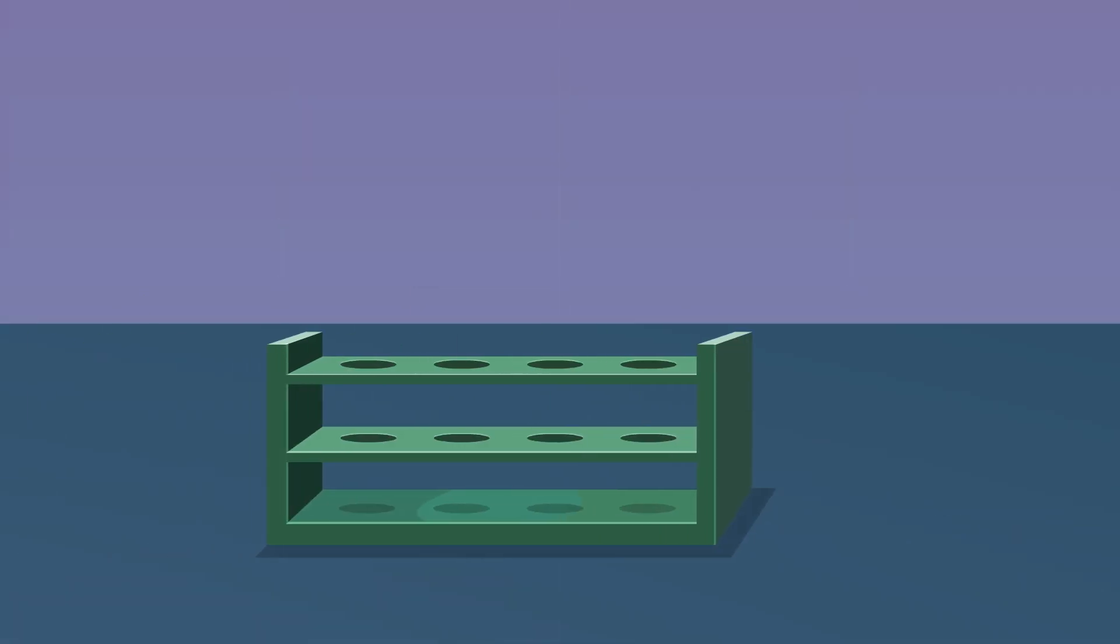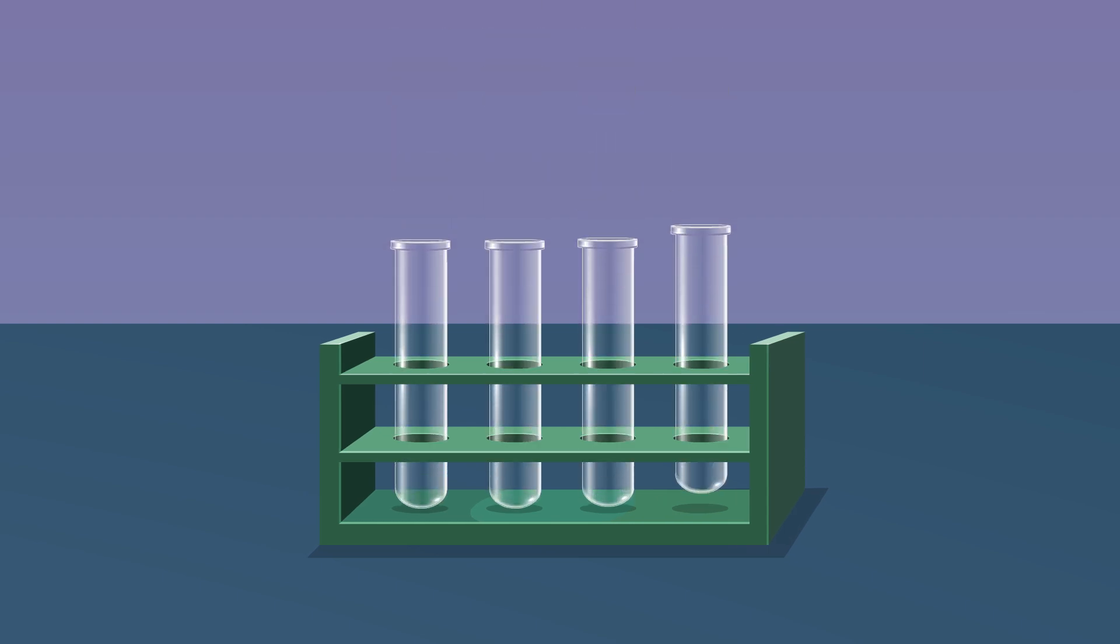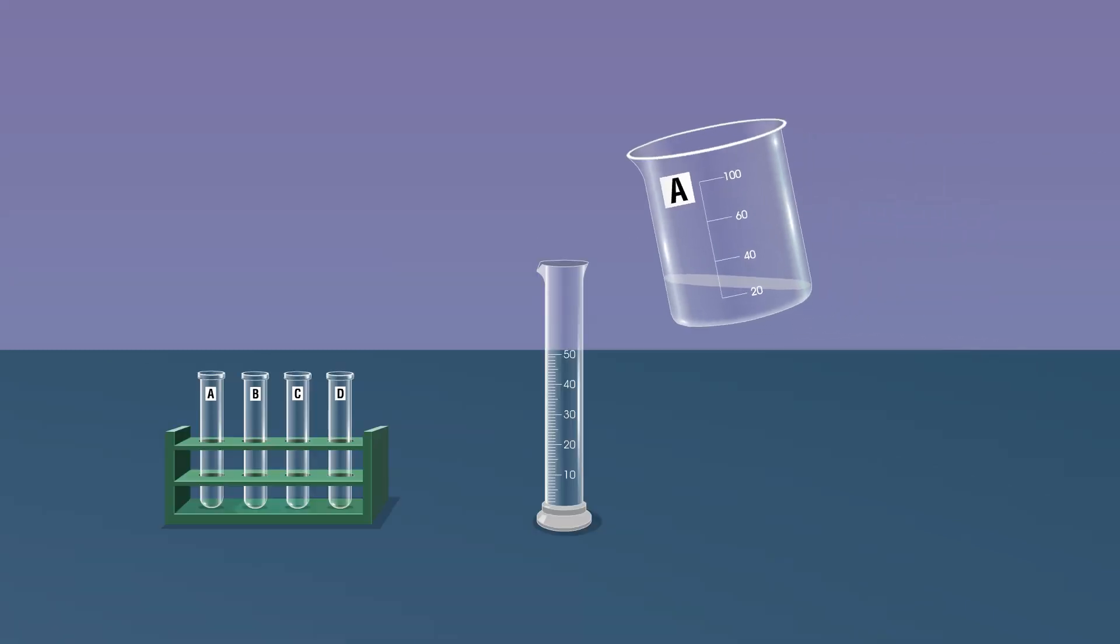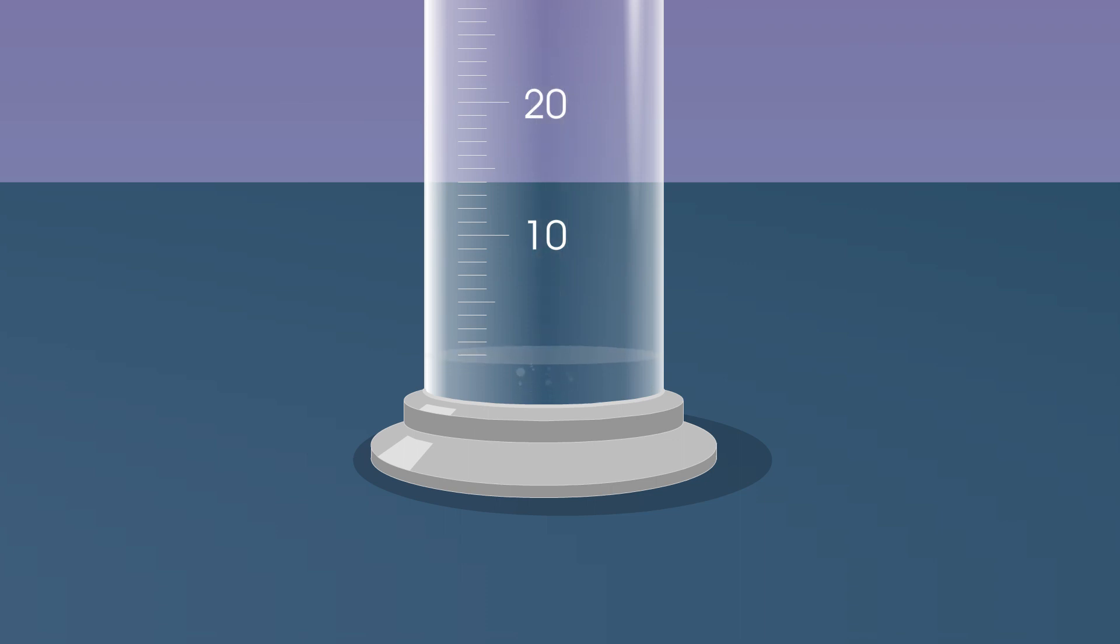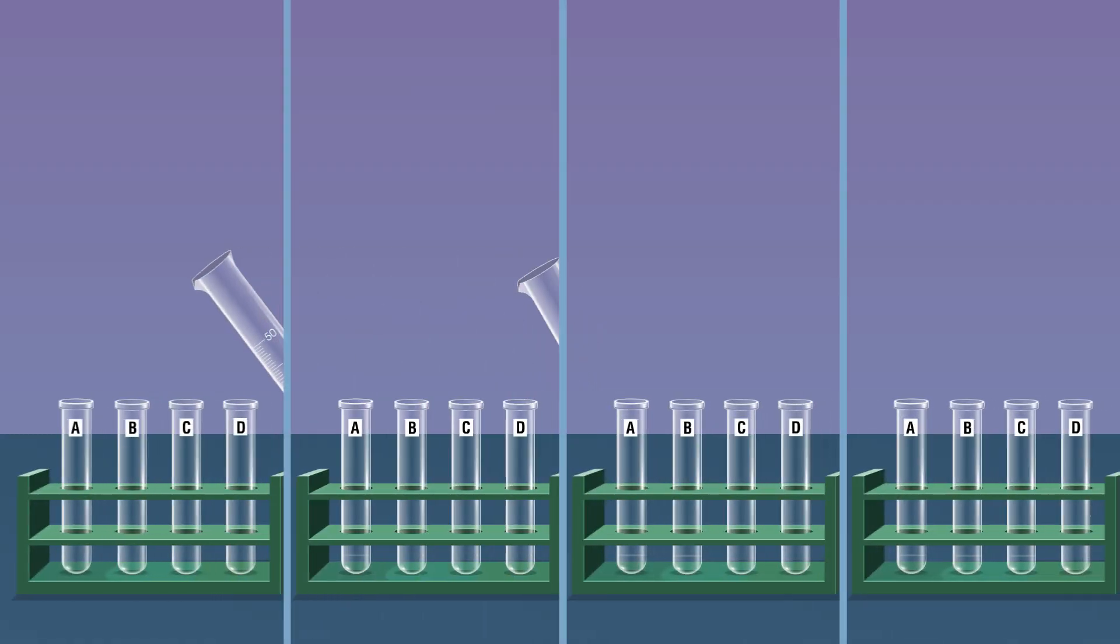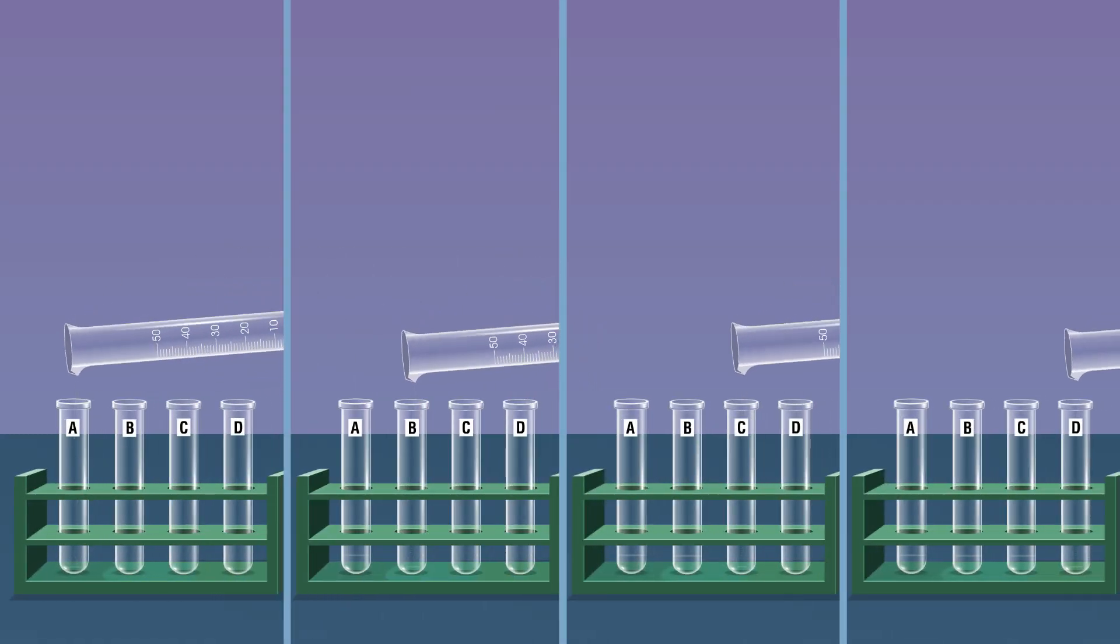Take a test tube stand, place the four test tubes and label them as tubes A, B, C, and D. Pour one ml each of the above prepared soap solutions using a measuring cylinder in the corresponding test tubes.